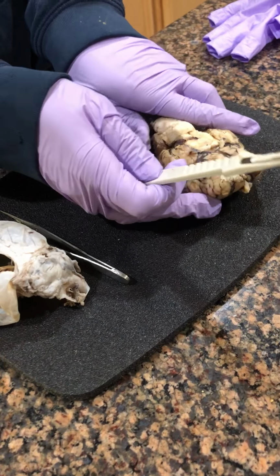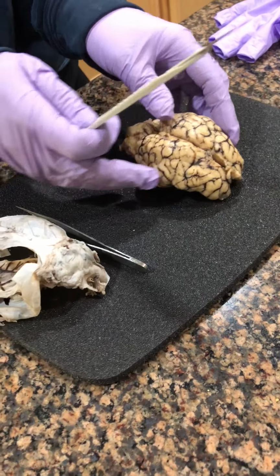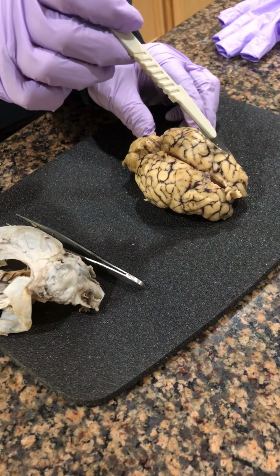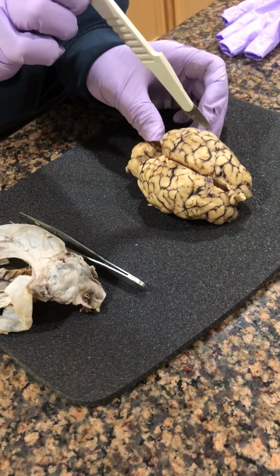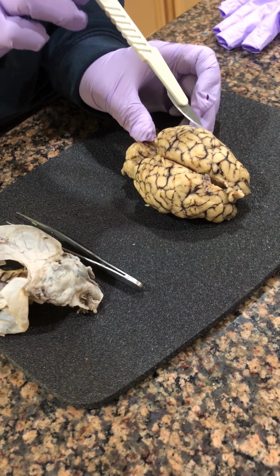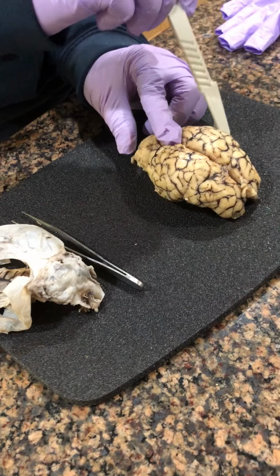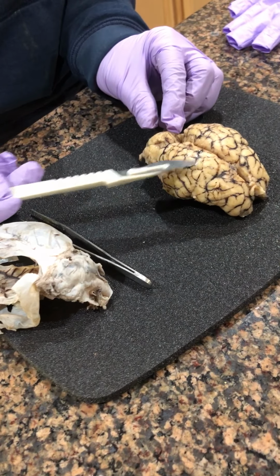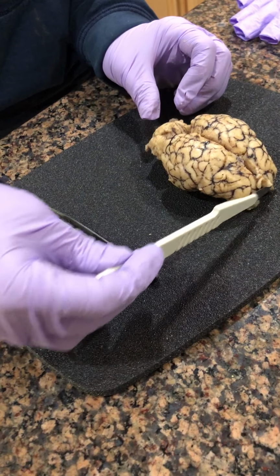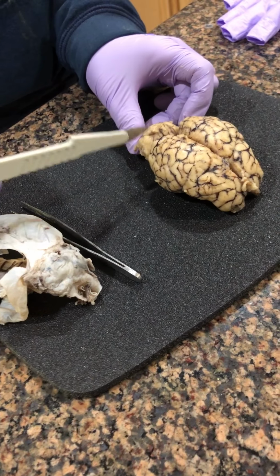Okay, and then if I turn the brain over, these grooves are the sulcus grooves. On the side over here is the gyrus, which is like the ridge. Your temporal lobes are going to be your sides. From this view, your parietal lobe is up here. The frontal lobe would be right over here, and your occipital lobe would be right back here in the back.